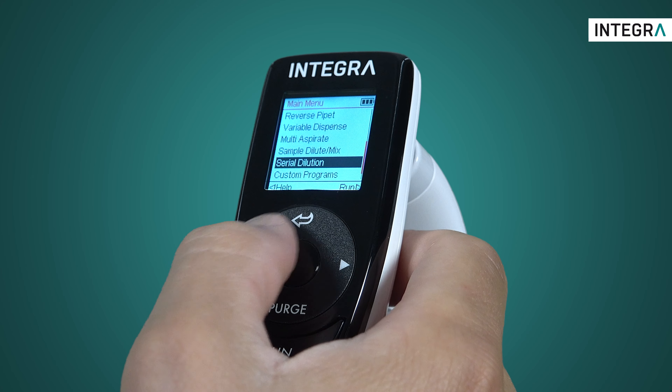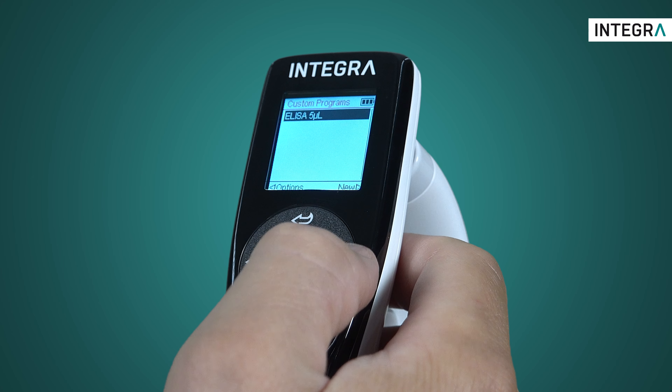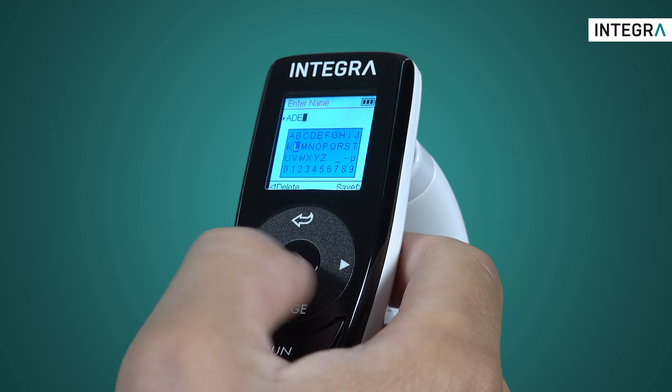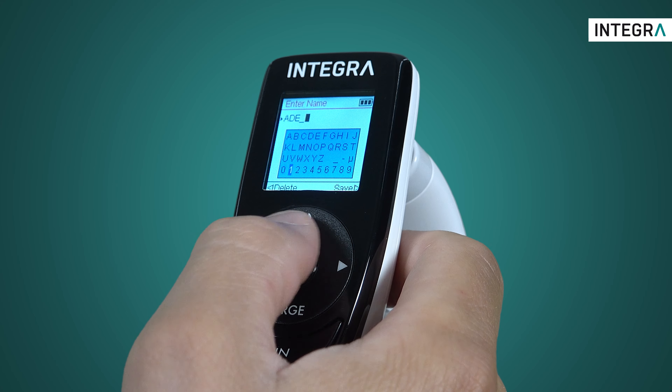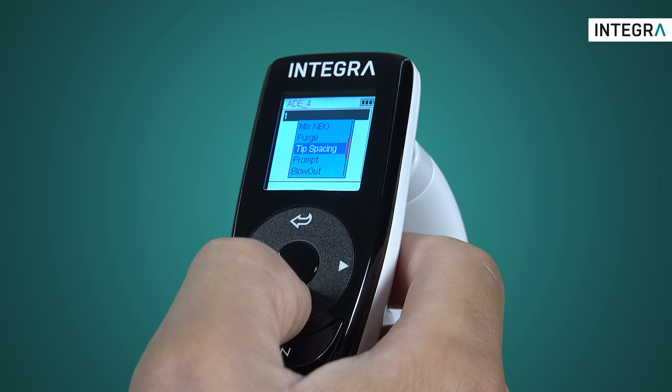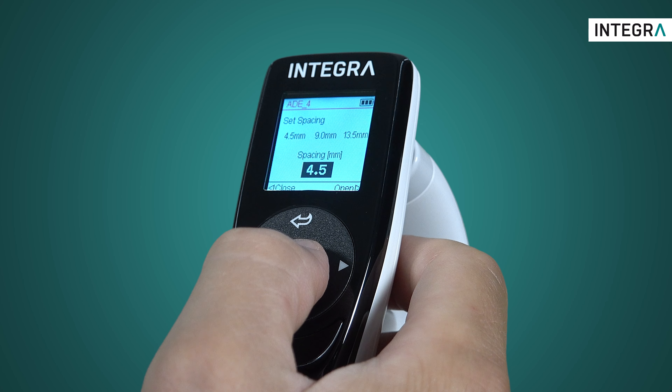From the main menu, enter the custom programs and make a new one. Give it a name, and you can then define every action that happens when Run is pressed. For example, the first step is a tip spacing, so I can have the tips in the correct position to aspirate from the source vessel.